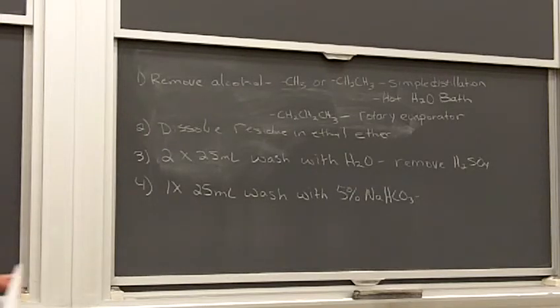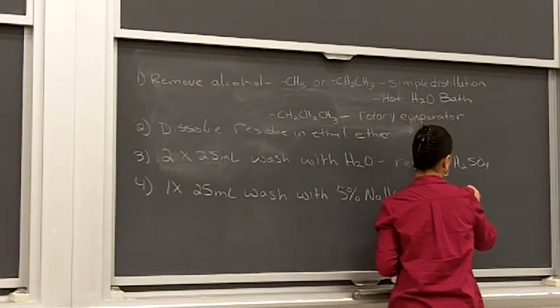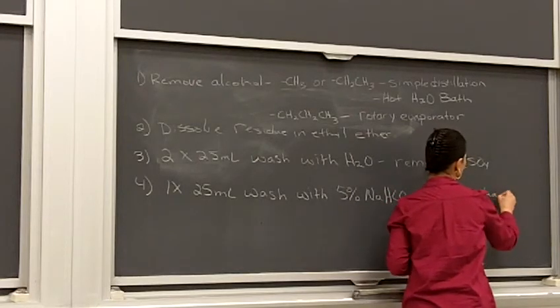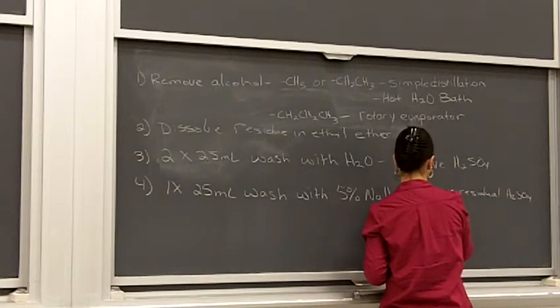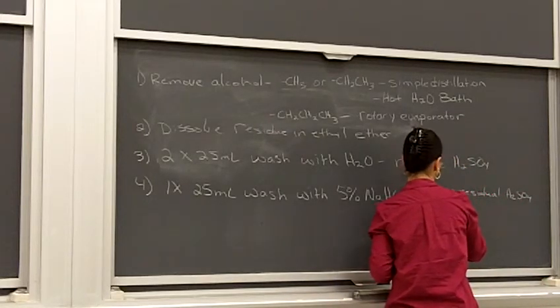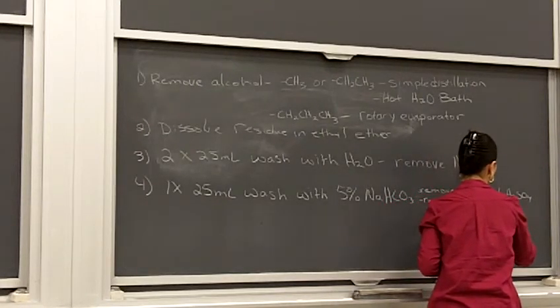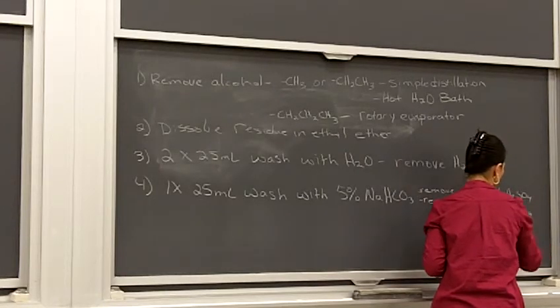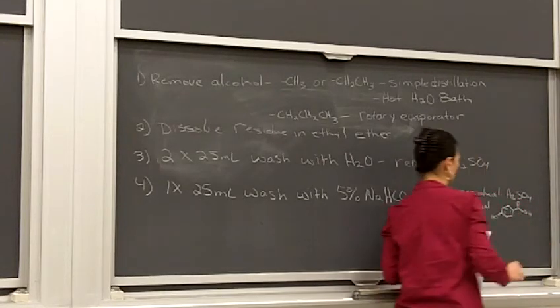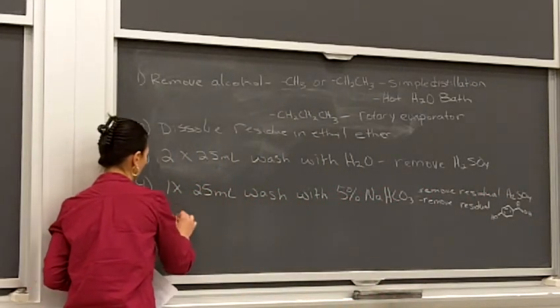Okay? So, we're using this to remove residual sulfuric acid and remove residual 4-hydroxybenzoic acid, which we call this is our starting material for the whole sequence. All right. Then we've got one more wash.